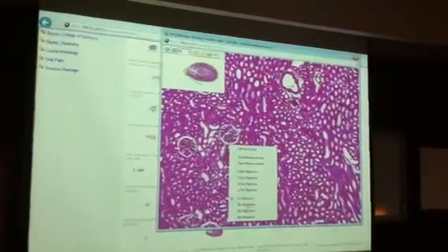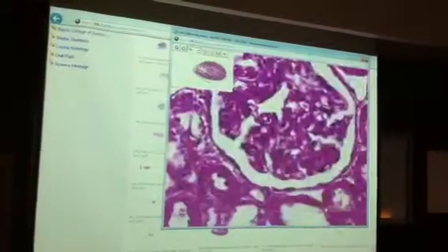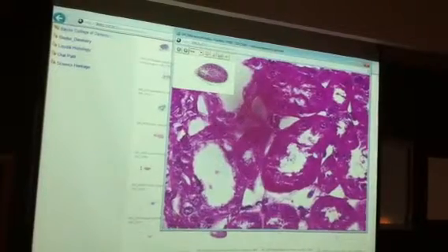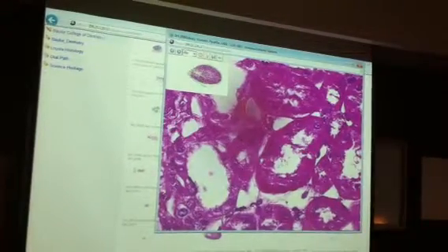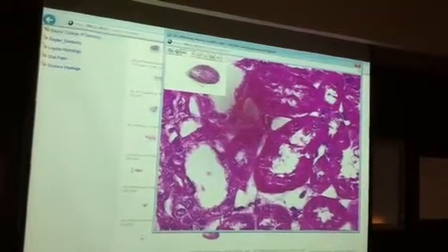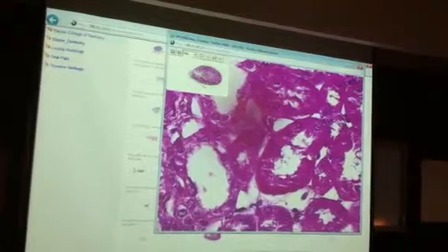Oh, I know one other thing I need to do that I'll do real quick. So when we were looking at here, you may sometimes see all the stuff inside the lumen of these vessels called the brush border, because that's really what it is. It's all these little fuzzy microvilli and stuff. That's also brush border, but don't worry about it. That other slide I showed you did. Two things I just remembered about.